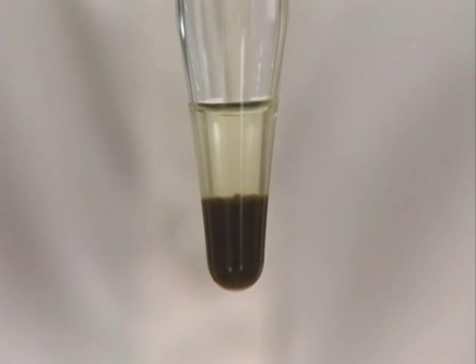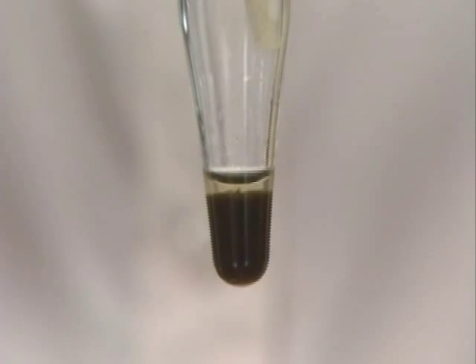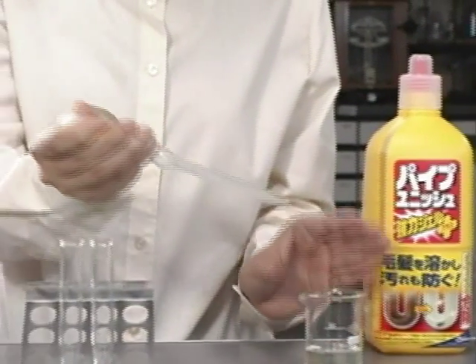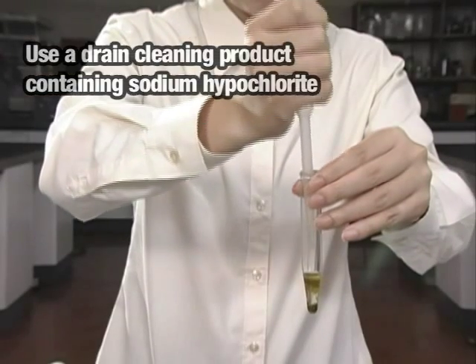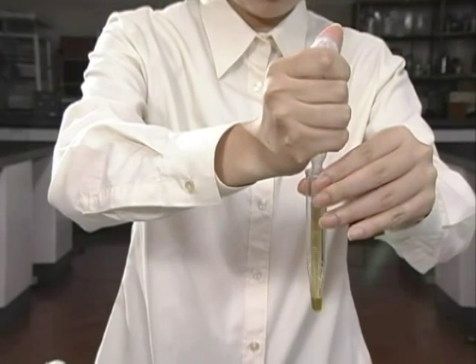Once the diatoms have settled to the bottom of the tube, the supernatant is removed. To the tube, two to three times the amount of the diatom sample of commercial drain cleaning product is added. Then, using a pipette, the mixture is gently mixed.